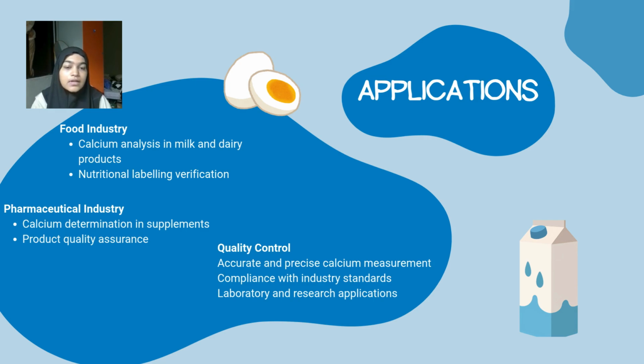And lastly, quality control. Gravimetric analysis is used for accurate and precise calcium measurement, also in compliance with industry standards and also in laboratory and research applications.